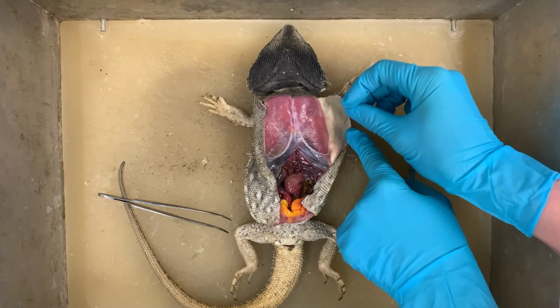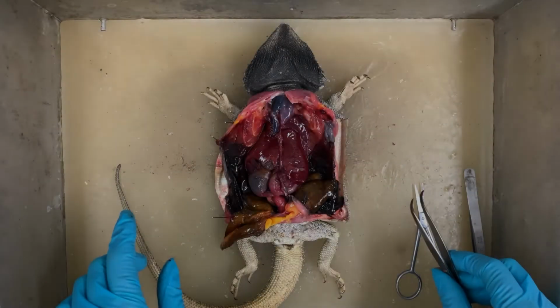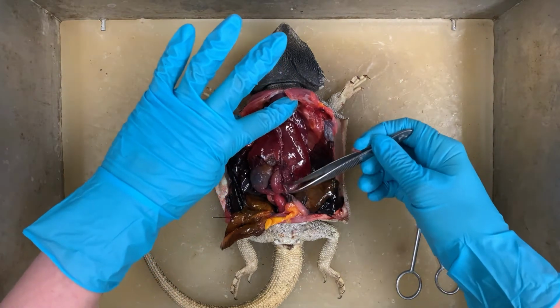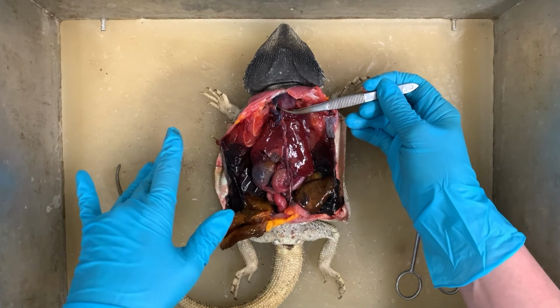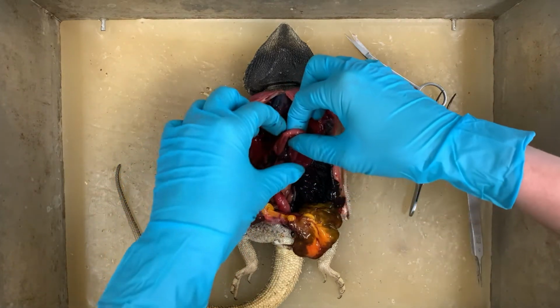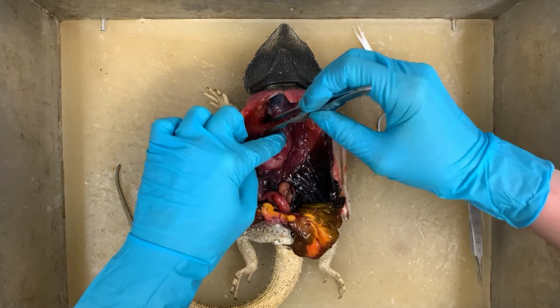As before, the skin of the body is pinned aside. Now, with the rib cage fully opened and the peritoneal wall pinned aside, we can see the full organs of the bearded dragon. Note that the peritoneal membrane of the bearded dragon is almost pure black. This is probably an adaptation for thermoregulation.